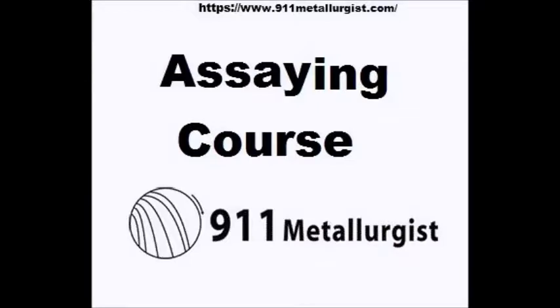A device often adopted in practice where a large number of assays of one kind are made, and the report is given as so many ounces or pounds to the ton, is that known as the assay ton. The assay ton may be any arbitrary and convenient weight, but its subdivisions must bear to it the same relation as pounds and ounces bear to the actual ton. On the other hand, in a laboratory where many kinds of work are performed, different sets of weights of this kind would only tend to confusion, even if they were not unnecessary.